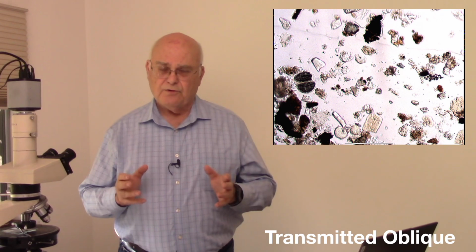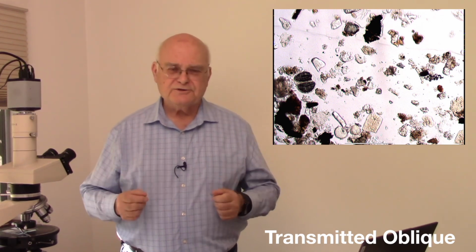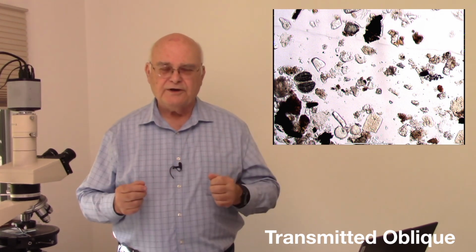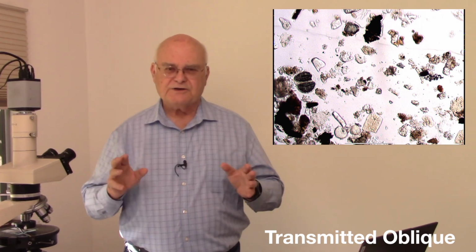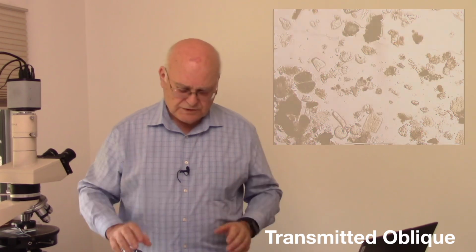Another advantage to oblique illumination is that the shading on the particles actually tells us whether the particle has a higher or a lower refractive index relative to the mounting media. We'll see that in another presentation, but that's another advantage that we'll see in the future.